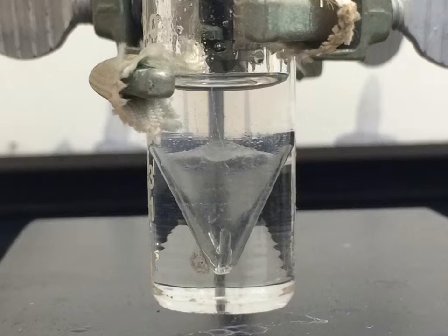Another error that could have altered the results was what happened to me and the pipette bulb. When I was mixing the solutions, the bulb shot the pipette out, and this resulted in having broken glass at the bottom of the centrifuge tube. This made it even more difficult to extract every last drop of the solution being extracted without getting some of the unwanted solution.